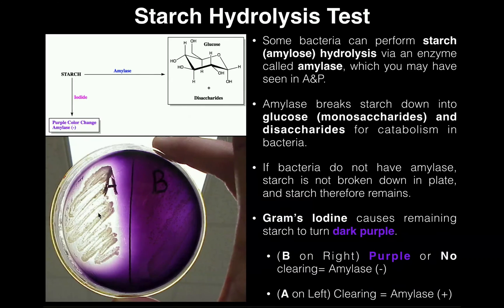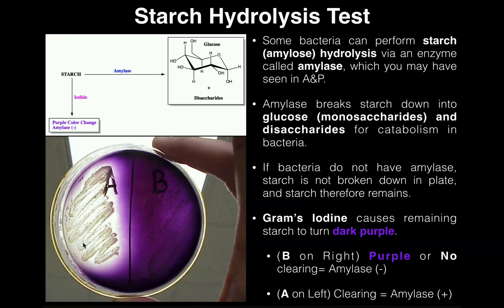In contrast, on the left side, we can clearly see that not all of it is purple. Everywhere around the smear directly, we actually see no purple — we can see a clearing around the smear. If you hold this up to a light, you can actually see directly through the plate. These organisms on the left are amylase positive. If you have an amylase positive organism, that means these organisms have the enzyme amylase — they possess this enzyme. Therefore, they are able to break down starch into the products. And so when you pour the iodine on there, it doesn't stain purple where there's no starch, creating what's called a zone of clearing that will manifest around the smear itself.